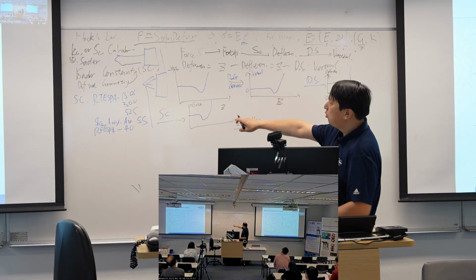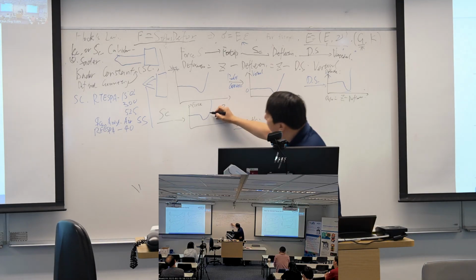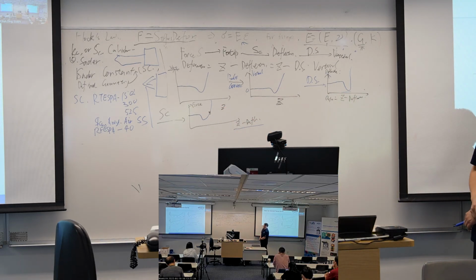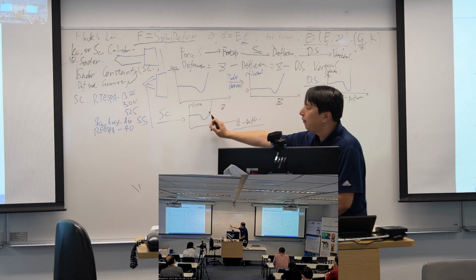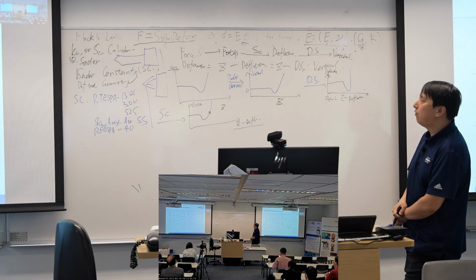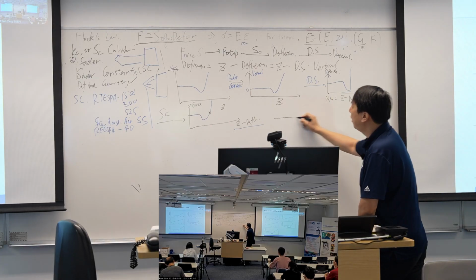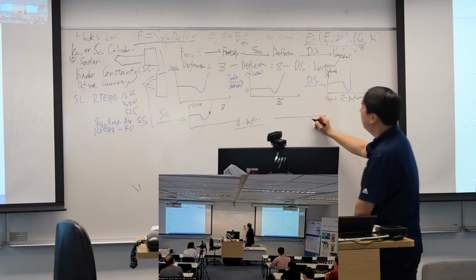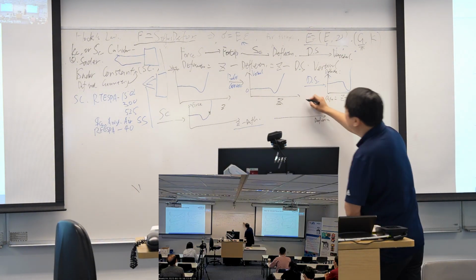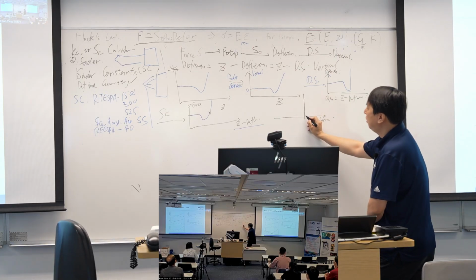So we need to tell the software this one is our contact point. After that, this is the 0 point of the deformation, so our curve will be deformation. The deformation is something like that. This one is 0.